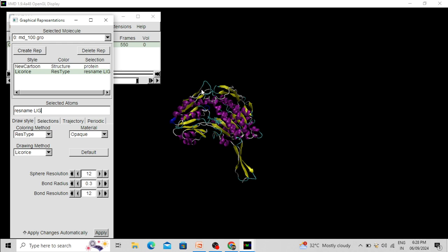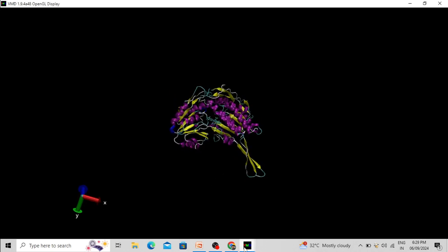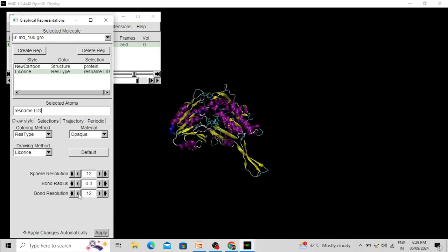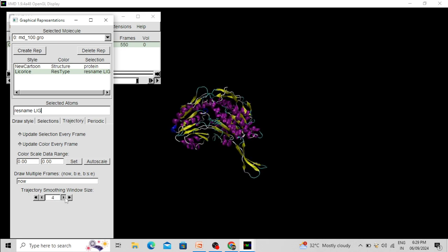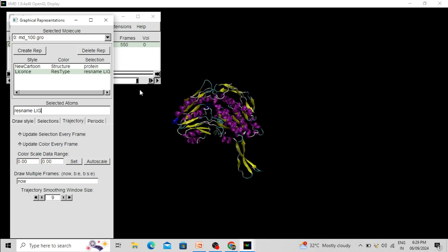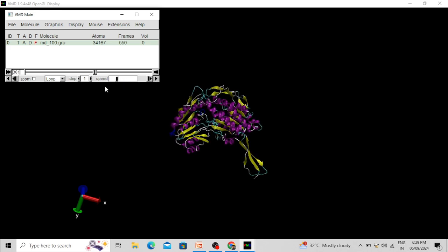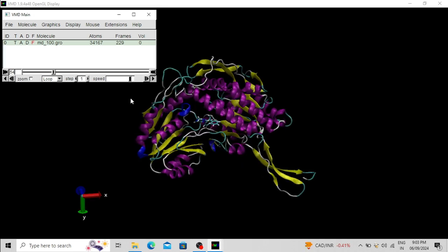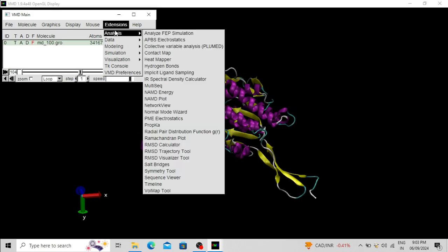Now only the protein molecule and ligand molecule are present. If you want to smooth the trajectory there is an option for trajectory smoothing. You can also change the speed of the simulation to slow it down. Now it's time to create the video — click Extensions, then Visualization, then Movie Maker.